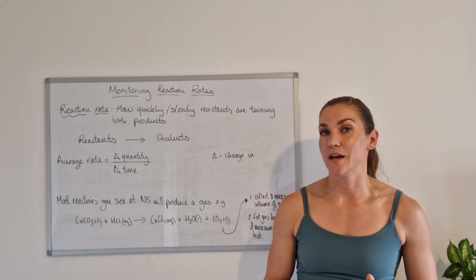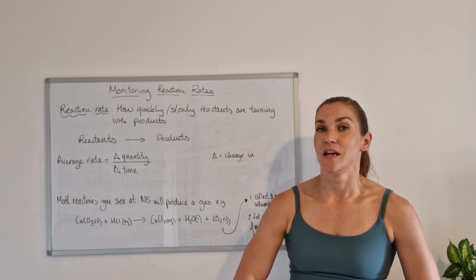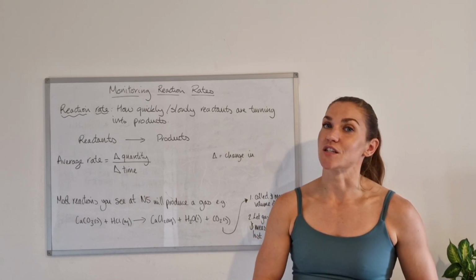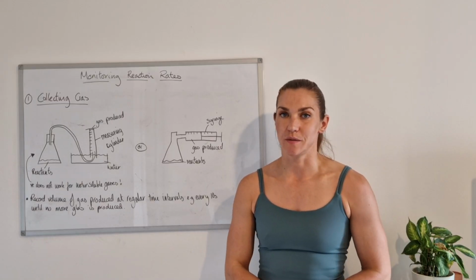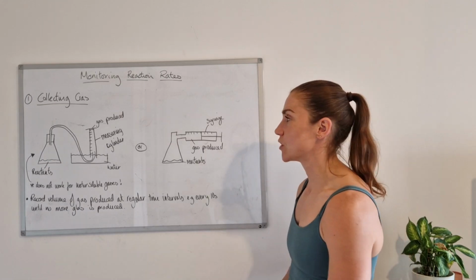What we're going to look at now is what these experiments actually look like apparatus-wise, and then talk a bit more about the procedure of carrying out a successful experiment. First of all, we're going to look at how we set the experiment up if we are collecting the gas. So that was option 1 that I gave before.